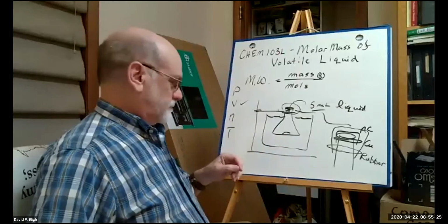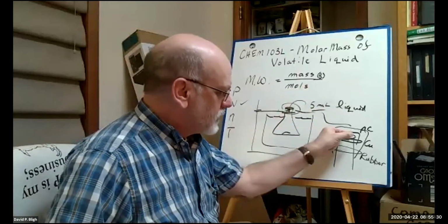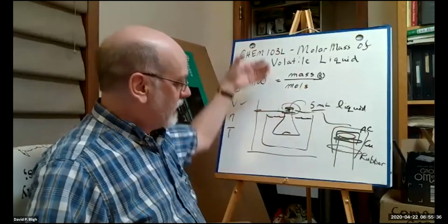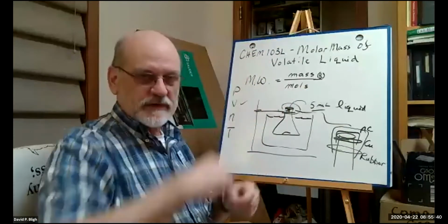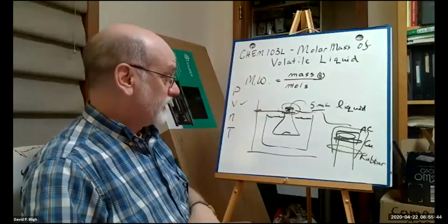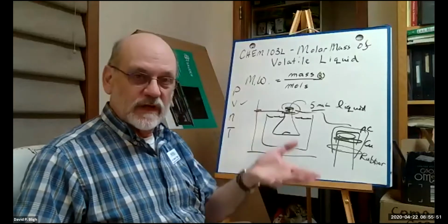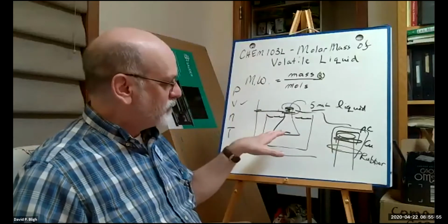Boiling point. So we've put the liquid in there, we put the small cap on it and the large aluminum foil cap on it. Now we submerge it and we poke a pinhole in the top through both pieces of aluminum. So that's how the vaporizing liquid escapes. Now, why did we put 5 milliliters?